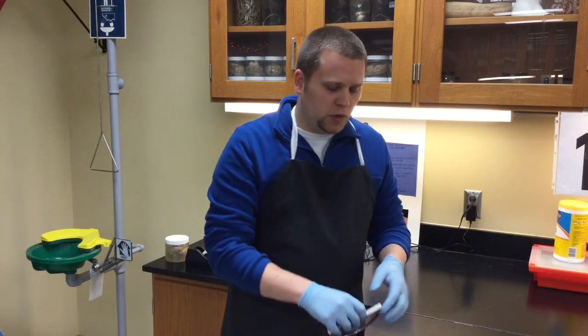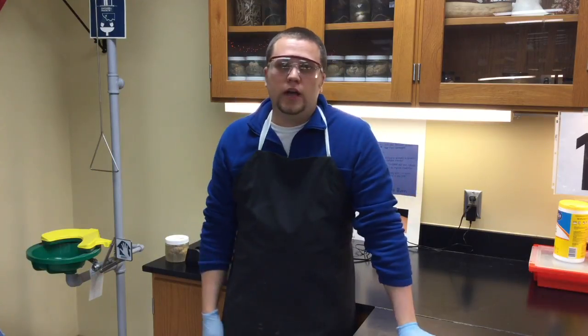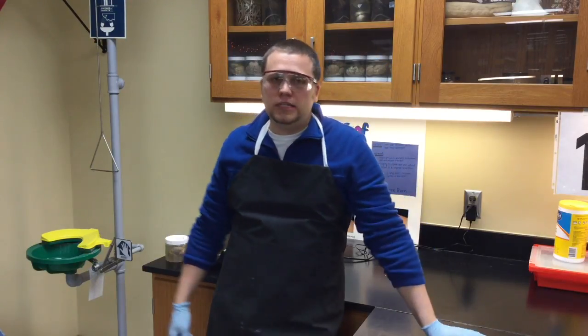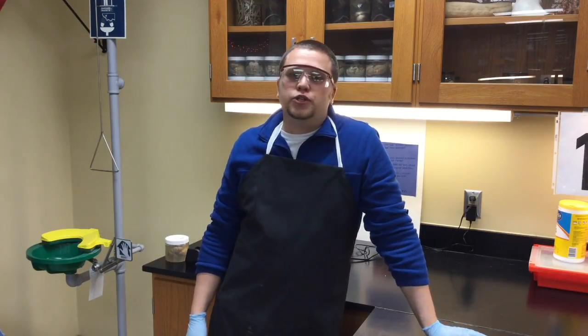The last thing that you're going to want to put on is going to be eye protection, like so. Now, if you have hair that is down to your shoulders or longer, you're going to want to make sure that it is tied back with a hair tie or a ponytail, to ensure that when you are bending over looking at your specimen, it does not get into your brain.